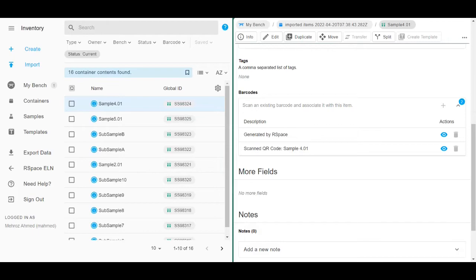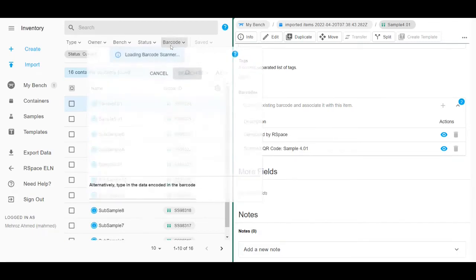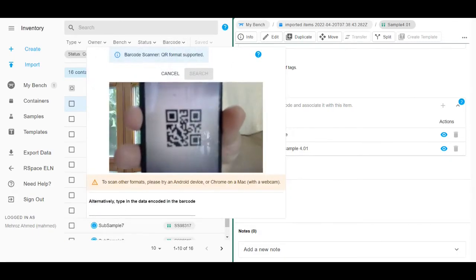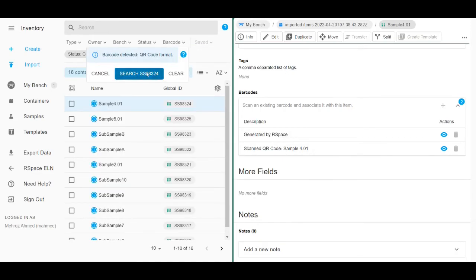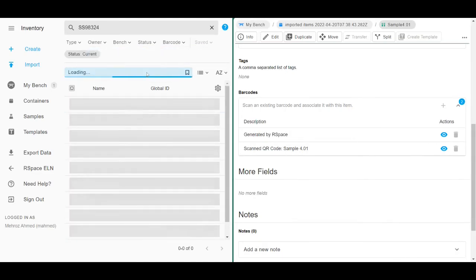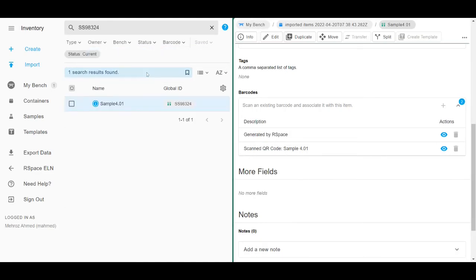To get started, go to the search bar and hit the barcode option. Scan the generated by RSpace barcode and you can see that our sample has come up.